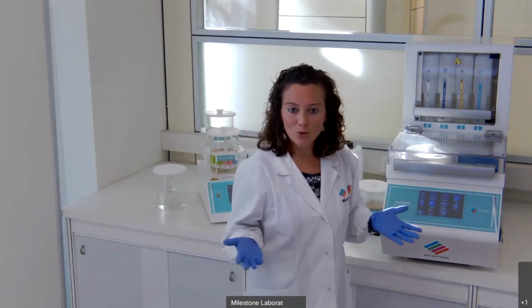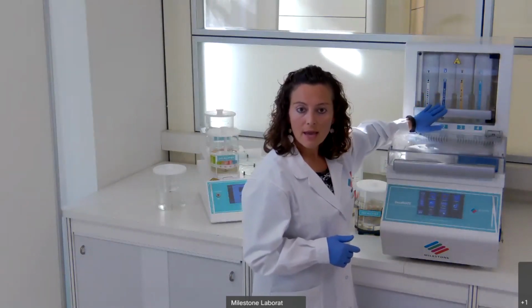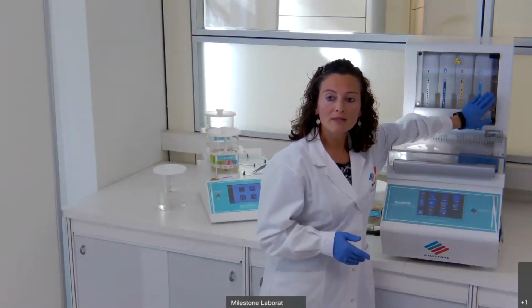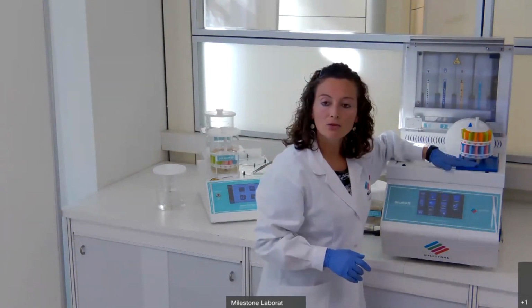Now, we move to the second unit that I want to show you, the decalmate. The decalmate can be considered the automatic evolution of the bone station, because as you can see, all the reagents are loaded in tanks, and the movement of the reagent is automatic from the tank to the cavity, where the samples are loaded. So no user intervention is needed to change the solution, and this allows you to have a really precise time of decalcification, because when the decalcification time is completed, the unit will automatically load a maintenance holding solution. Once the samples are in this solution, it's possible to open the cavity, put the cover in the dedicated area, and check the specimen in this lateral part of the unit.